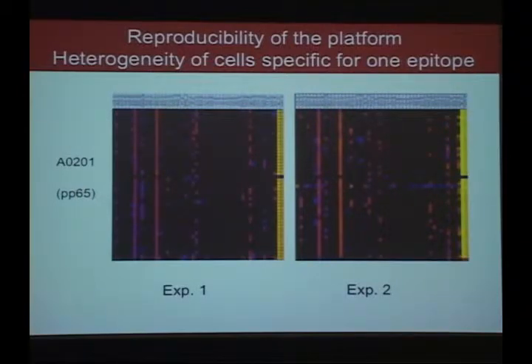Yeah. When you're normalizing, do you always follow the same protocol? Like you can choose your threshold, you can do a global, for example. We just do it to the positive control. Yeah, we do it per gene, and we do normalization to the control. Global normalization is a little dangerous, I think, because the cells can be different from one chip to the next.